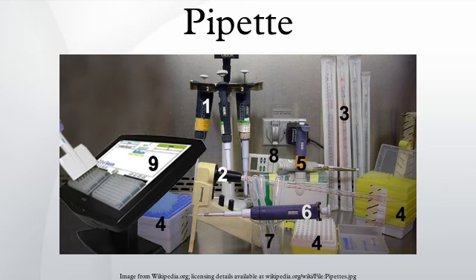Afterwards, the co-founder of the biotechnology company Eppendorf, Dr. Heinrich Netheler, inherited the rights and initiated the global and general use of micropipettes in labs. In 1972, the adjustable micropipette was invented at the University of Wisconsin-Madison by several people, primarily Warren Gilson and Henry Lardy. Micropipette brands include Gilson, Ergo-1, Eppendorf, Hamilton, Rainin, Drummond, Brandtech, Oxford, Hirschmann, BioHit, Labnet, Nichiryo, Corning, Vistalab, Thermo, Jencons, Vertex, Handipet, and Precis.